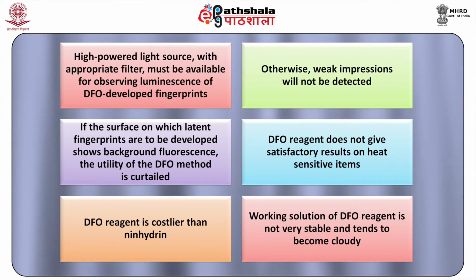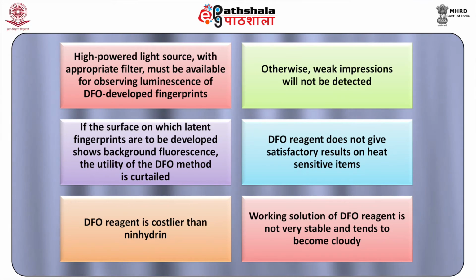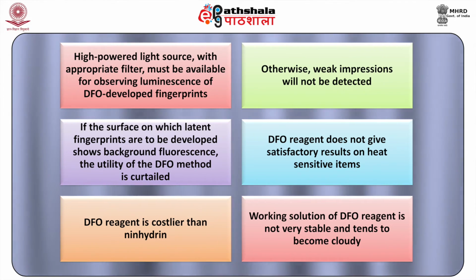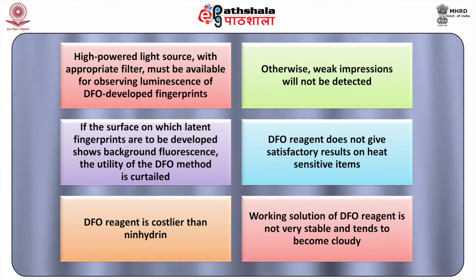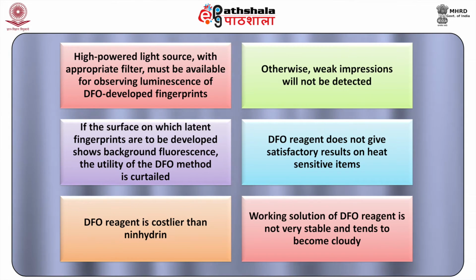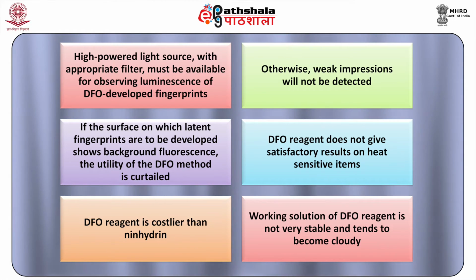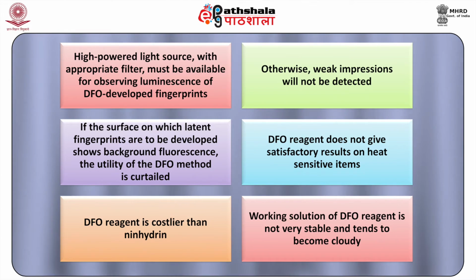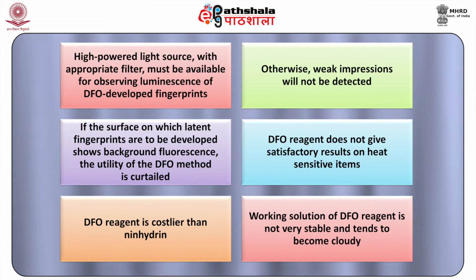developed shows background fluorescence, the utility of the DFO method is curtailed. Number 3. DFO reagent does not give satisfactory results on heat-sensitive items like thermal paper, window envelopes, and labels on polyethylene articles. Number 4. DFO reagent is costlier than Ninhydrin. Number 5. The working solution of DFO reagent is not very stable and tends to become cloudy.